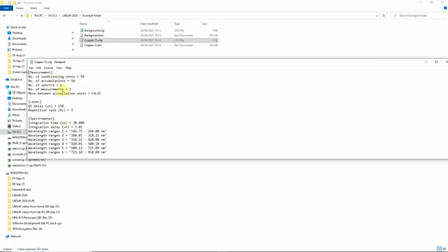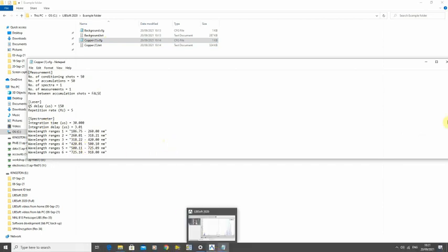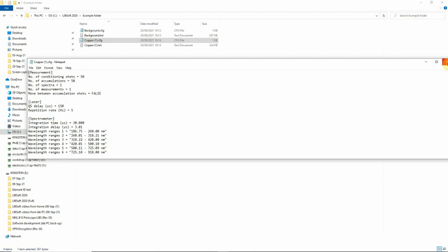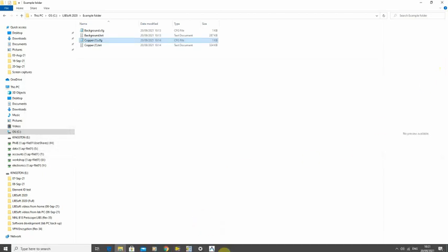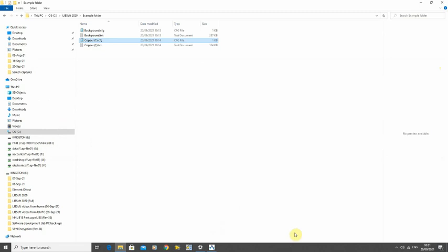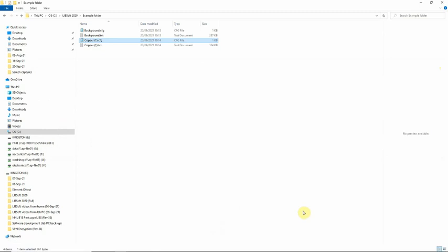And we can see that it contains all the parameters we set for the acquisition of that spectrum. The data in this configuration file can also be displayed using LIBSoft spectrum display and manipulation tools, and this is described in a separate video.